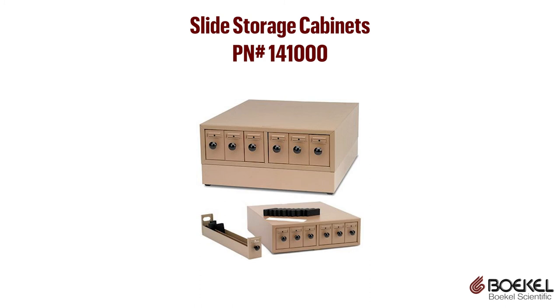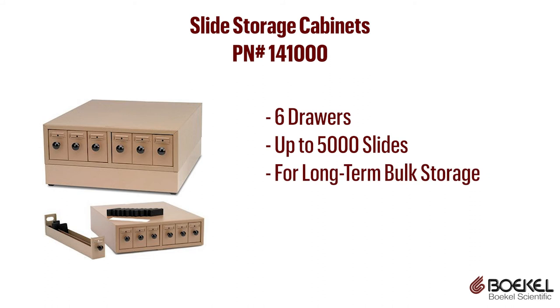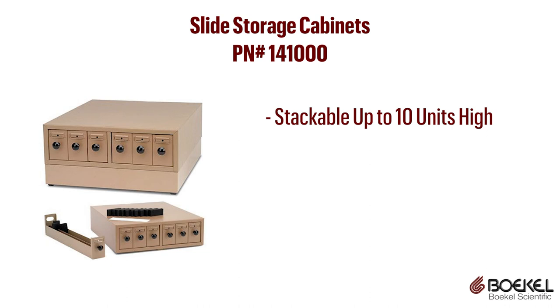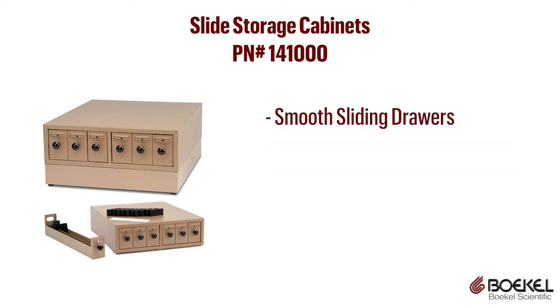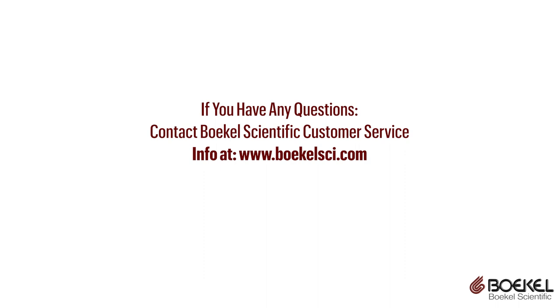Bocal Scientific offers long-term and short-term slide storage solutions. Bocal slide storage cabinets are six-drawer metal cabinets that can hold up to 5,000 standard microscope slides, used for long-term bulk storage of important slides. The cabinets can be stacked up to 10 units high, and a base is available for floor-stacked or tall bench installations. The units have smooth sliding drawers, and spacers and plastic dividers are included for organizing.